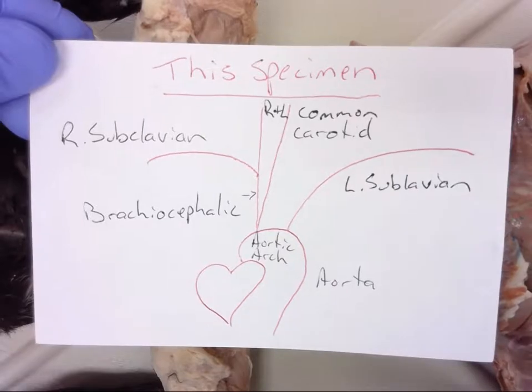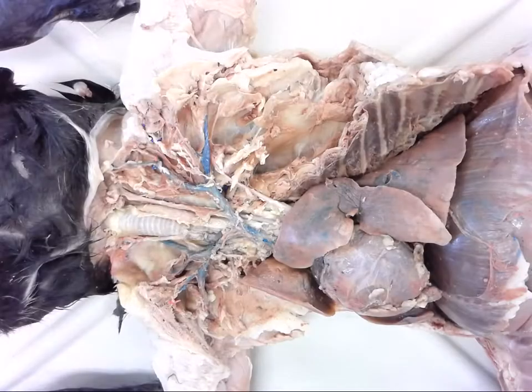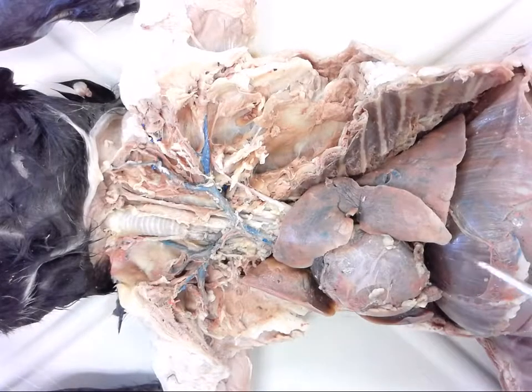So we'll go ahead and take a look at what we have here. All right, so in this specimen we have the lungs here.